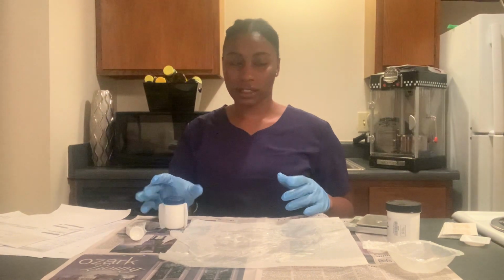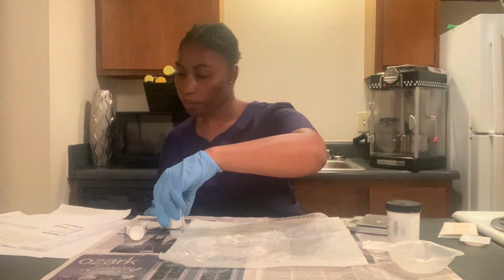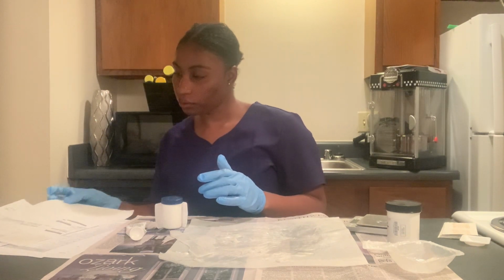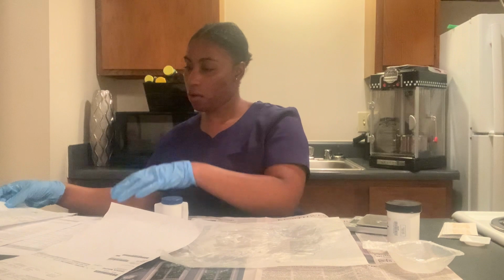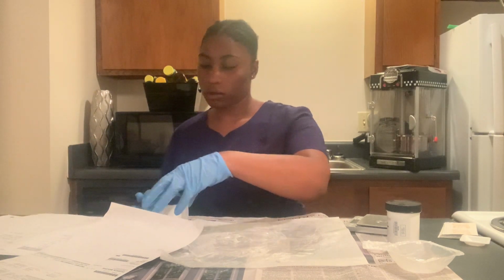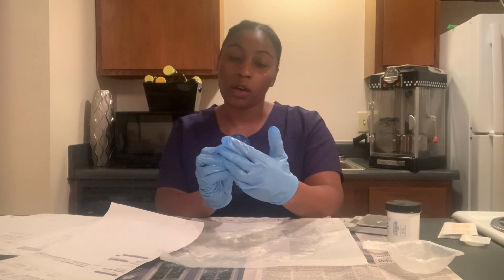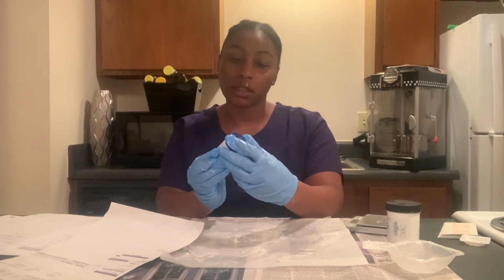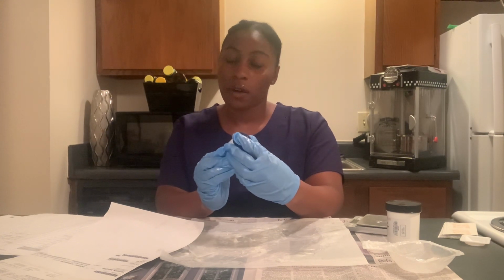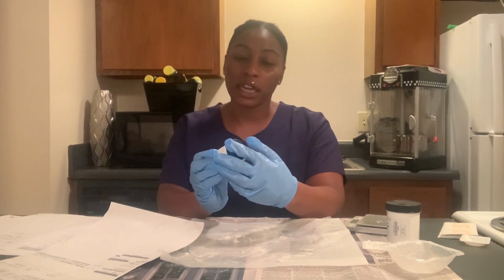And then I have to assign the correct beyond use date. So on the prescription, what it says is 12/14/2020, and it is going to be 30 days from now.